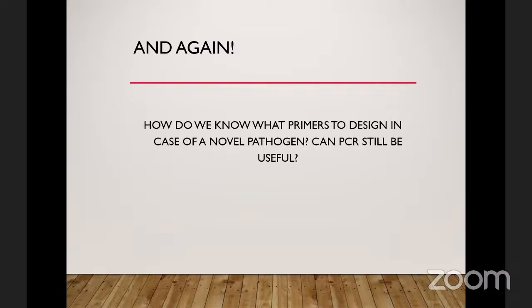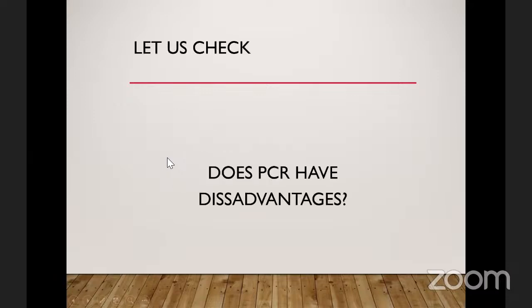The answer is yes. The major disadvantage of this technique also comes from its major strengths. Like we have said, it can amplify few copies of DNA, and you have several thousands of copies of DNA, or millions of copies, or billions of copies of DNA from your singular sample. So small contaminating DNA can also amplify and give you false positive results. So that's an advantage, a disadvantage.